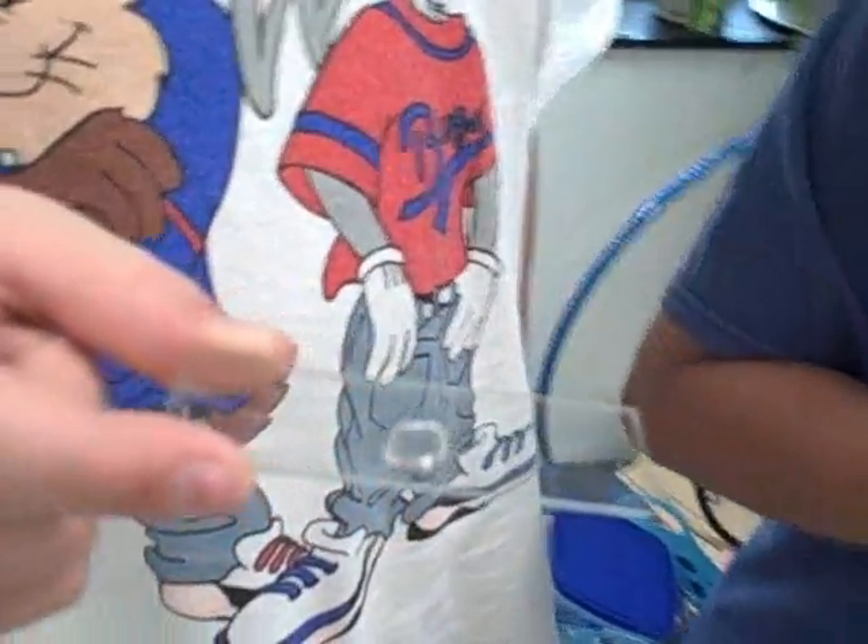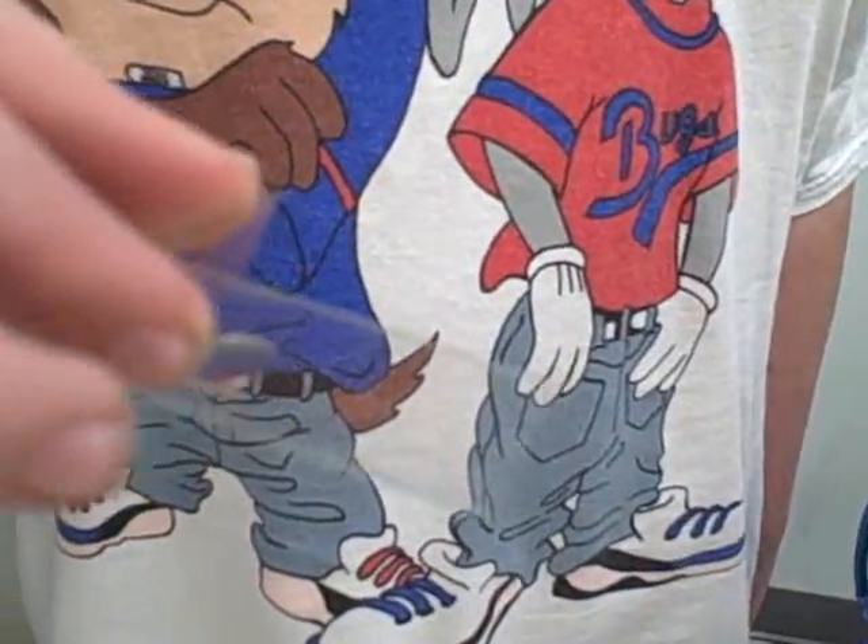Now you take a cover slip and slowly put the cover slip down so that you don't get any air bubbles.